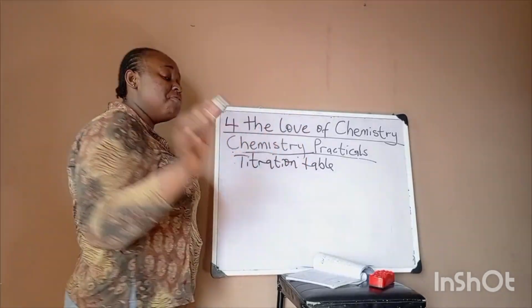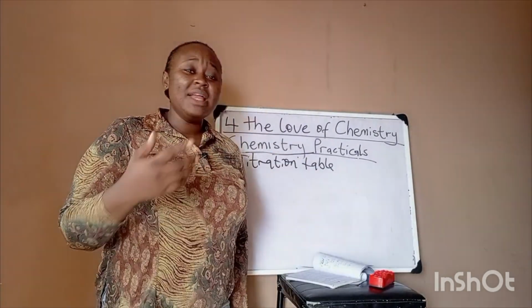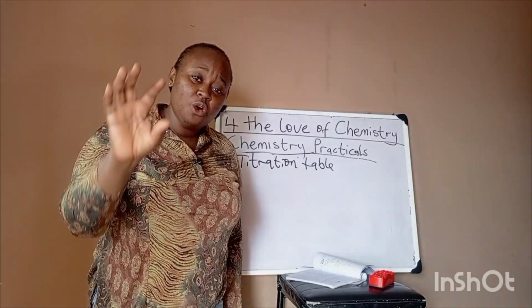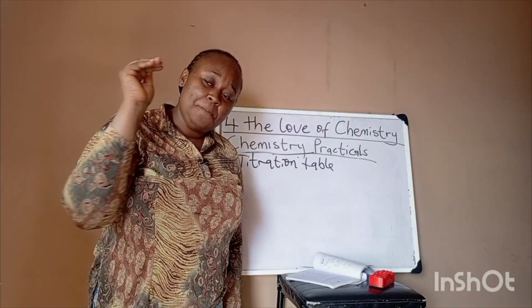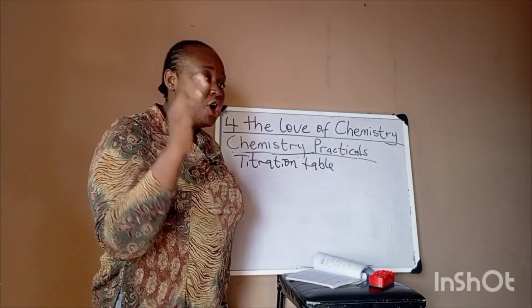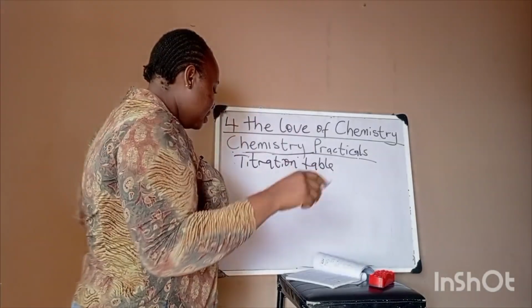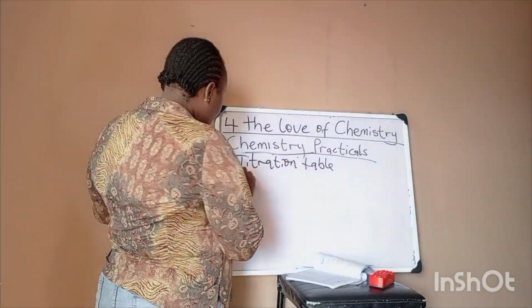So now, the first thing you do, even before you start your practical or anything, is to draw your table and put in your parameters. Then when you get your numbers, you fix them in correctly. Now, listen very attentively. So the first thing you do is we start with this.